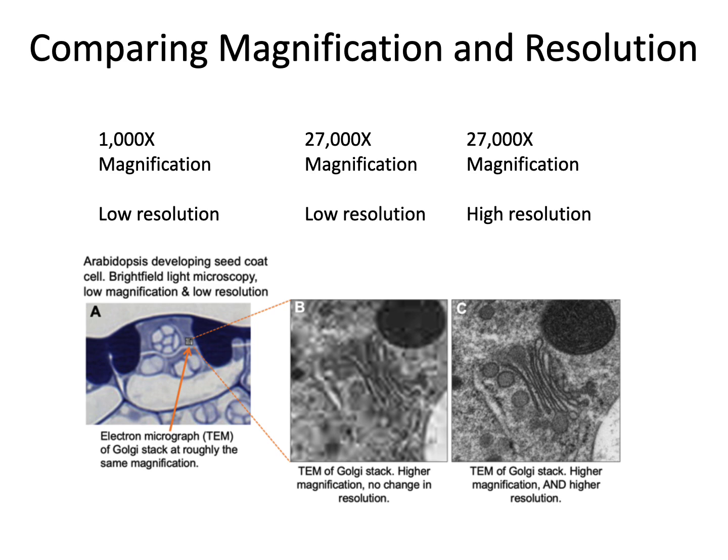In this picture to the left, we're using light microscopy for 1,000-fold magnification, which could be a standard 100 times objective with the 10 times ocular lens. That is a reasonable setup for 1,000-fold magnification, and it's something that can be done pretty easily with light microscopy.